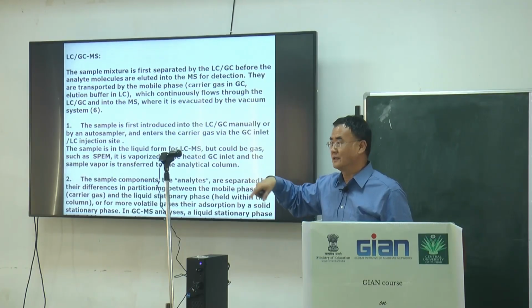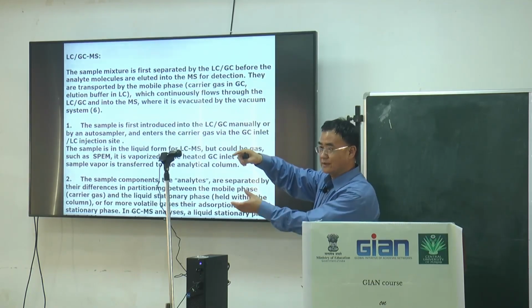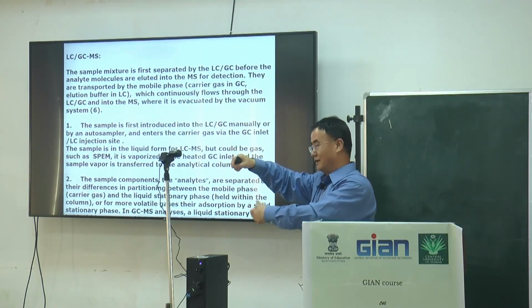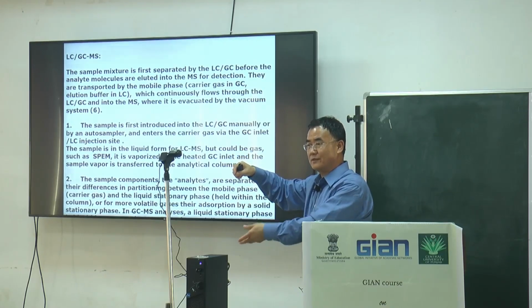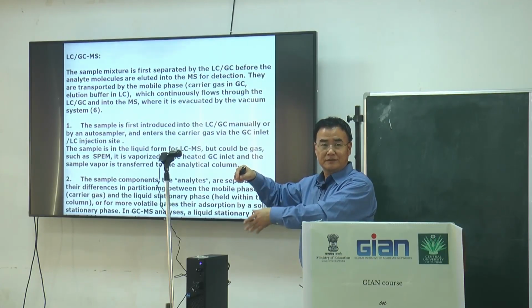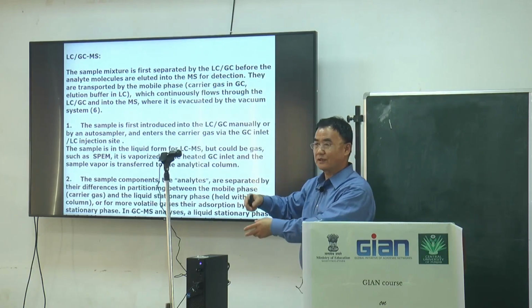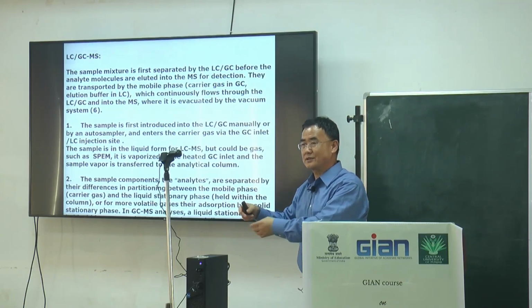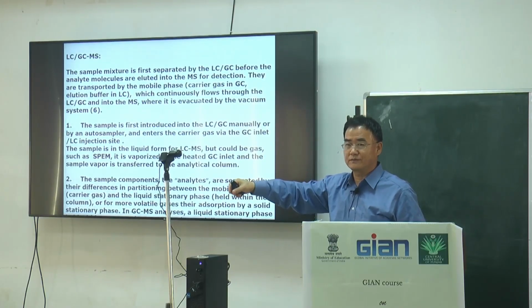This is called solid phase extraction. Sometimes we use a fiber. This fiber is put in the headspace of a container holding a plant sample, a dry sample, a tea sample, or another plant that emits some fragrance. The fiber slowly gets saturated and absorbs all the fragrance.